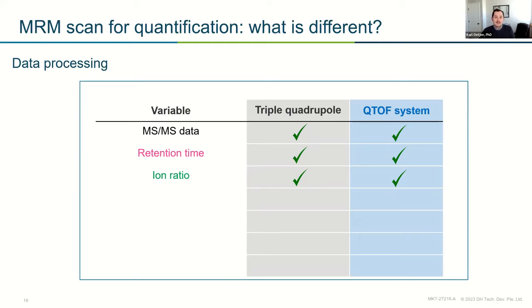That being said, I think almost all of us have been in a situation where we have all these pieces of evidence and there's still something kind of telling us that something's not right. Maybe the retention time is slightly off, but it's still within your accepted window. Maybe the ion ratio is just a little confusing. It's within that 20% tolerance that you set, but it's unlike any of the other ions you've seen or your standards, and you're just a little concerned.